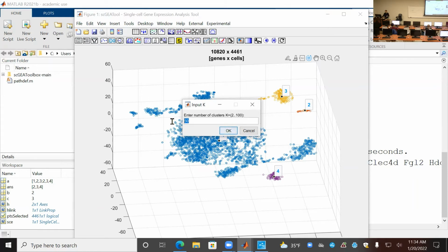The larger number here is good, we figured out, because you want to have an independent cluster for these small groups. For example, we want to have a small group for this one and that one and annotate them independently. And if they are the same, later we merge them. Otherwise, we can separate them.